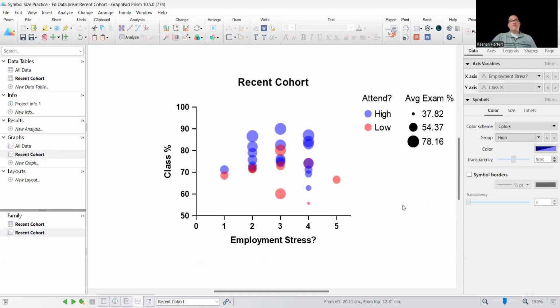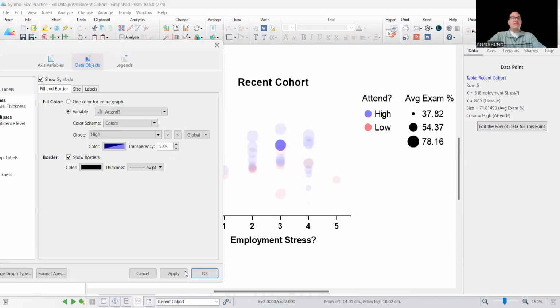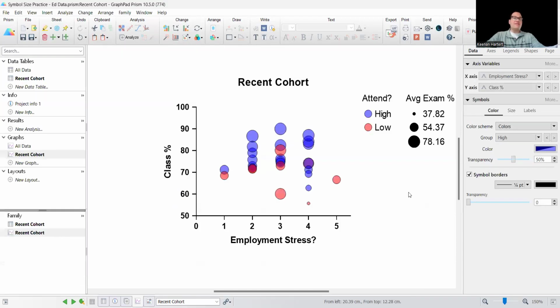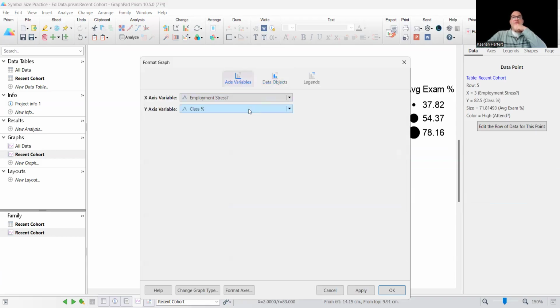And then that's going to give you a really nice visual, depending on what you're after, just looking at right here. So again, some other details that you can always add. I love showing the borders on the little plots, things like that. That's not technically a dot plot size issue as much. Color and transparency is also very important, and it took a while to master, but it's very useful.